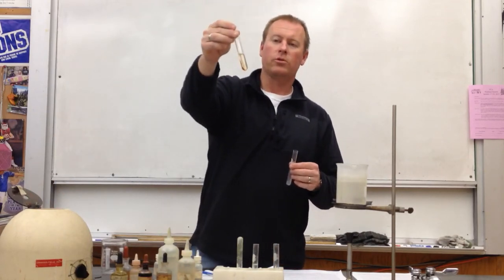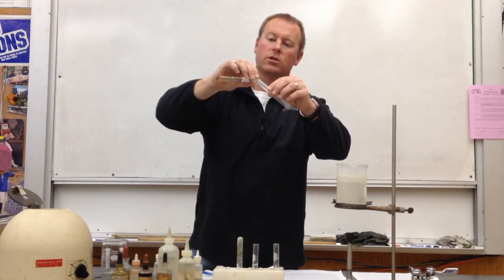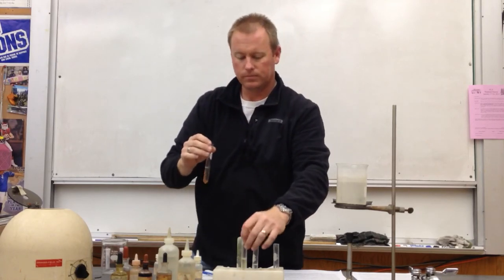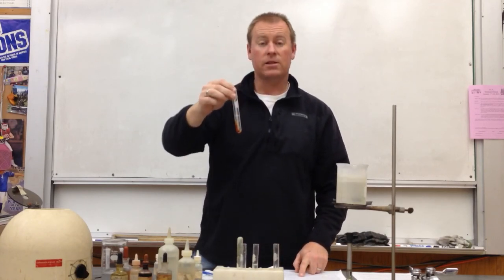Alright, so this rust-colored precipitate is stuck to the side wall. I'm going to carefully pour the solution into another test tube, and this is the precipitate that will be treated in step 7. That's it for step 6.